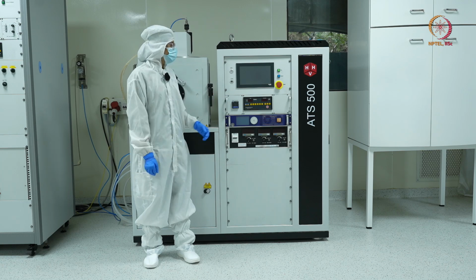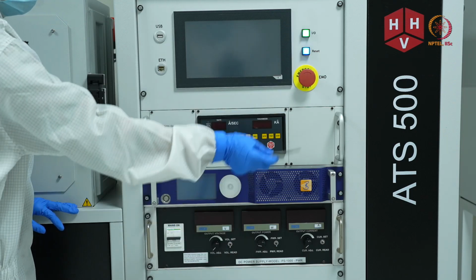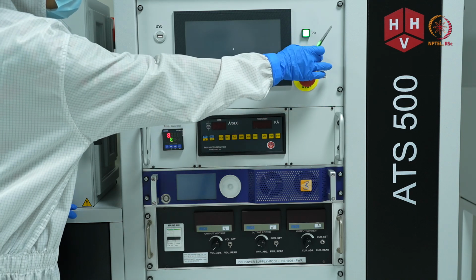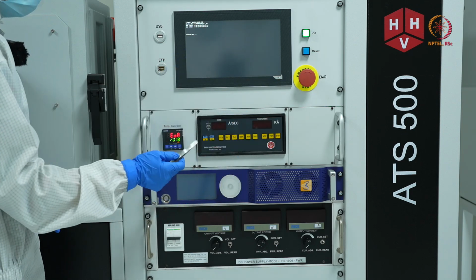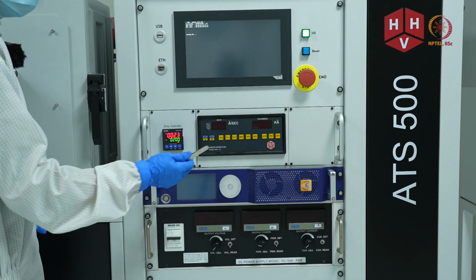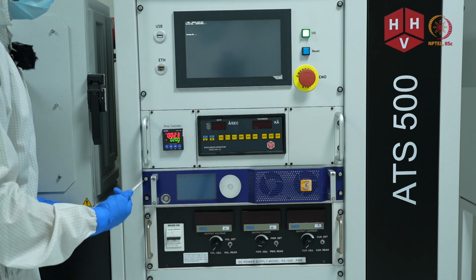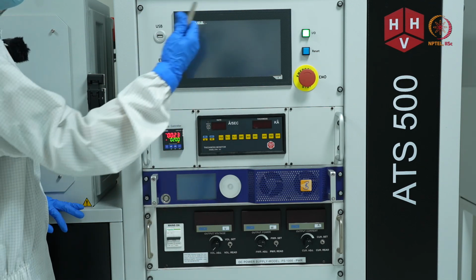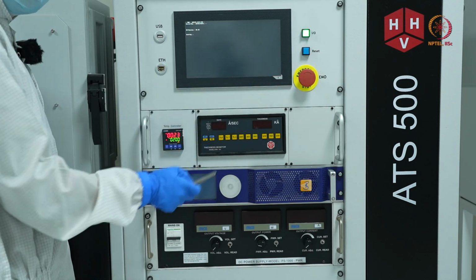For this, I'll press start or IO. Every time I press start, I'll press reset. This is a hardware reset. It will reset all my electronics, and we can start the tool once all the safety interlocks and water cooling have been checked at the point when I press reset.